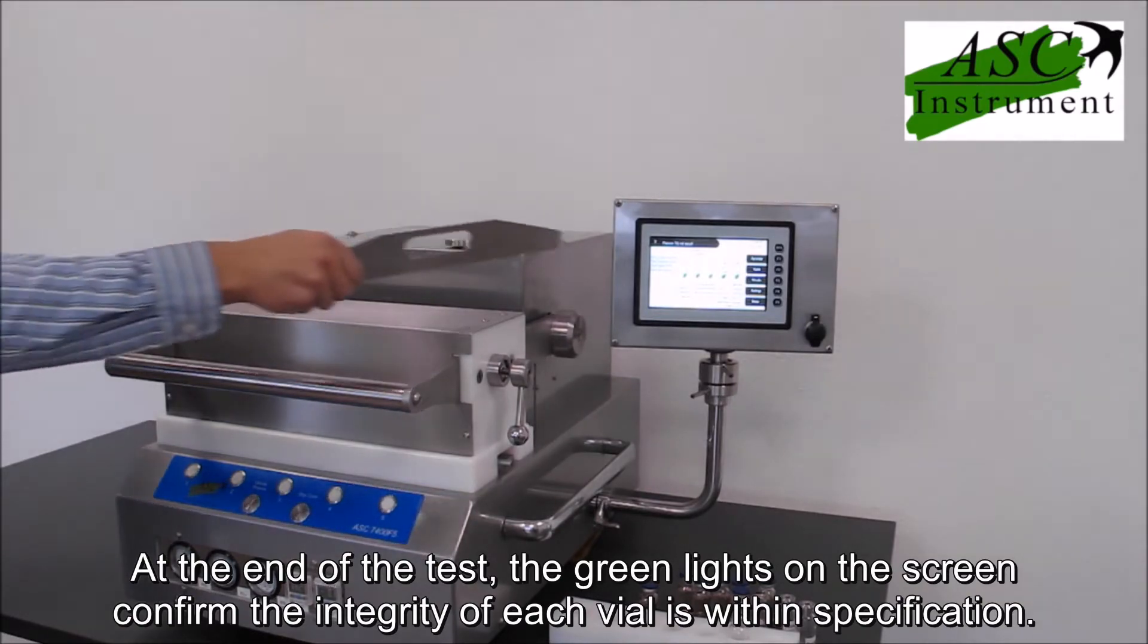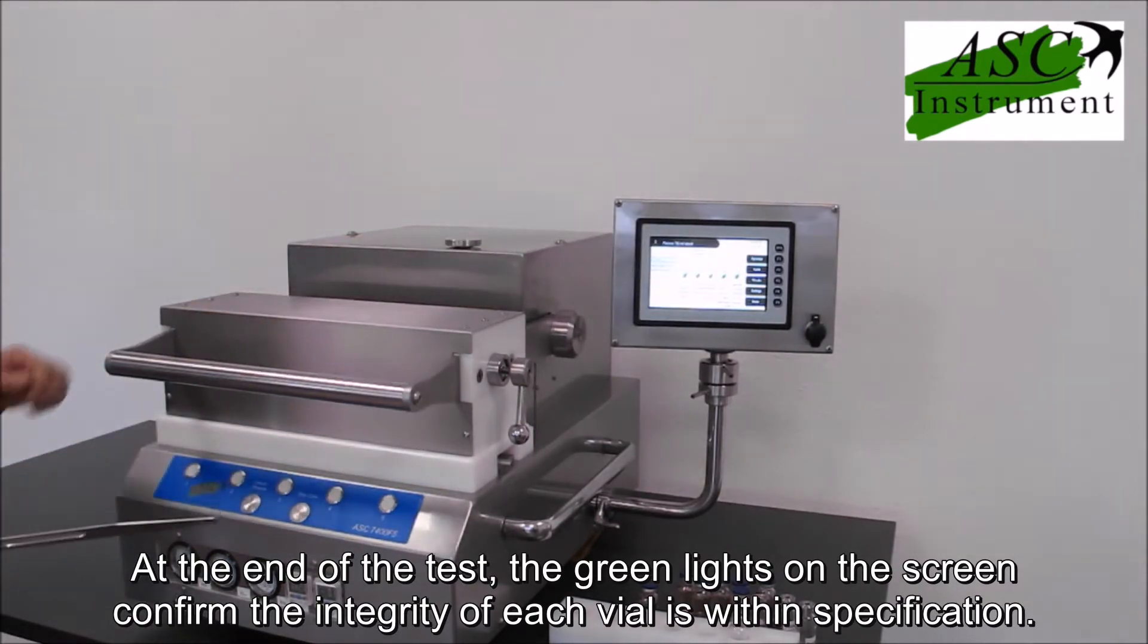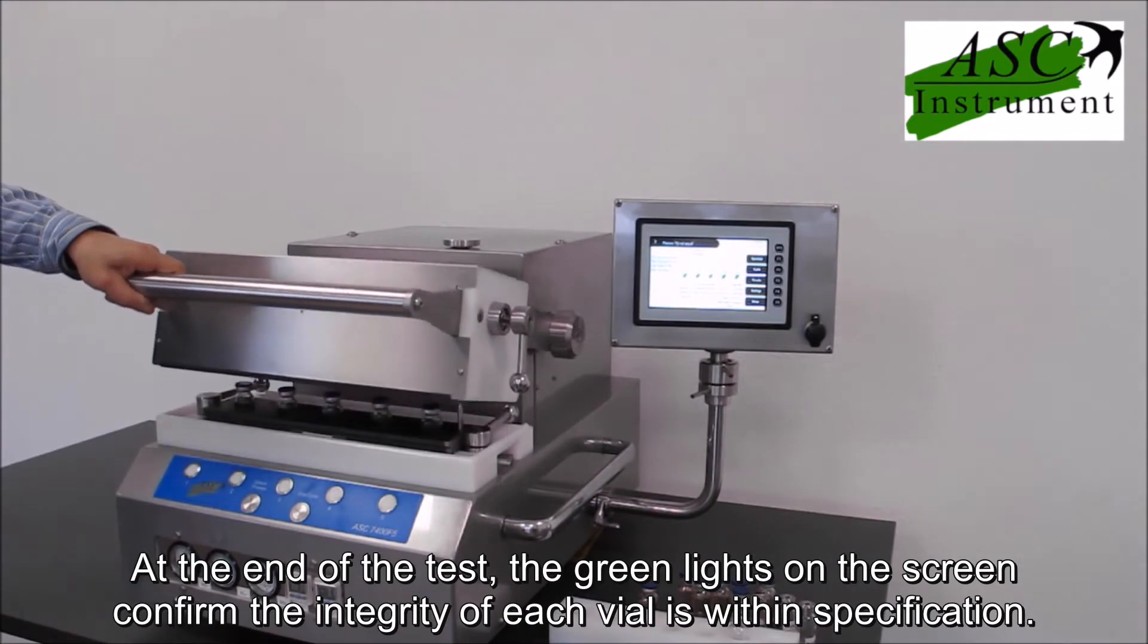At the end of the test, the green lights on the screen confirm the integrity of each vial is within specification.